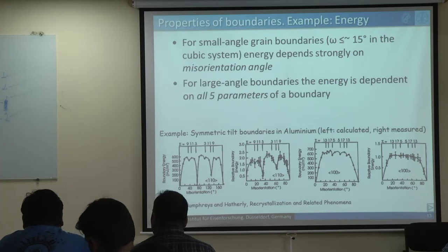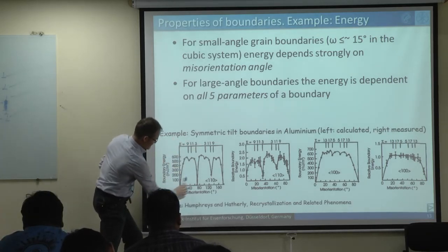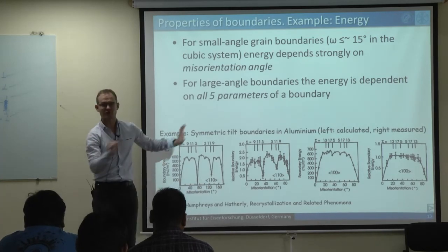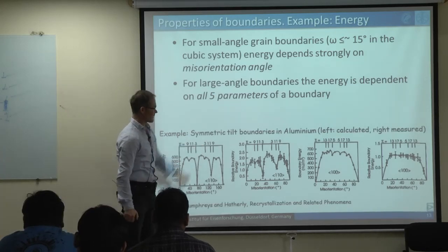You know, also the twin I can describe by 576 different misorientations. And if I constantly rotate, I always come back to the description 60 degree, but I can also describe it with 70 degree. And that's what they did here. They continuously rotate. They come to 60 degree, and then at some other angle, this is not 70 degree, but some 90 degree or something, there's also certainly a sigma 3 misorientation. It's one of the list of 576 misorientations. So the sigma 3 appears several times there.